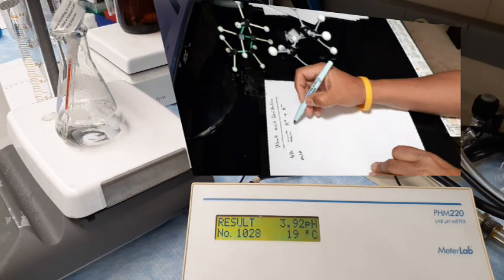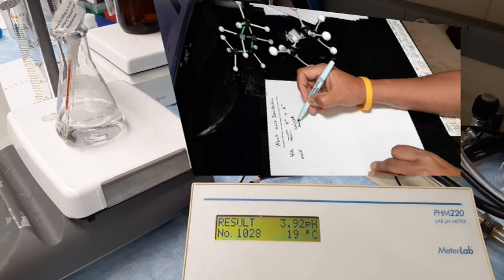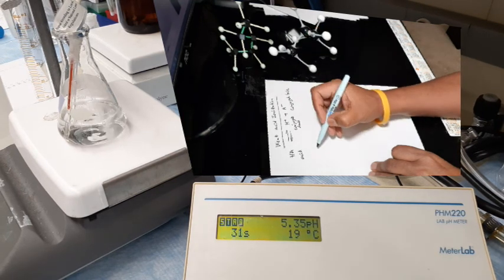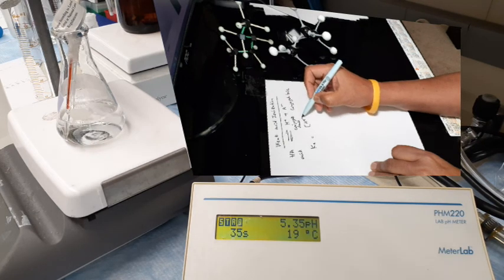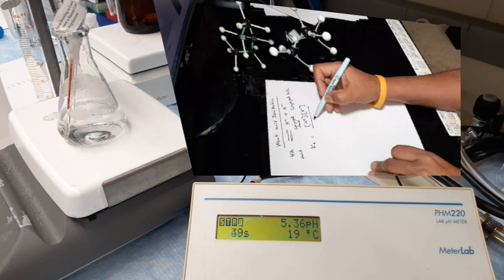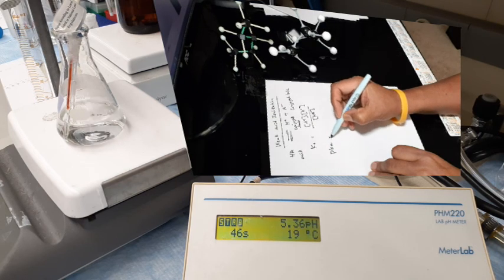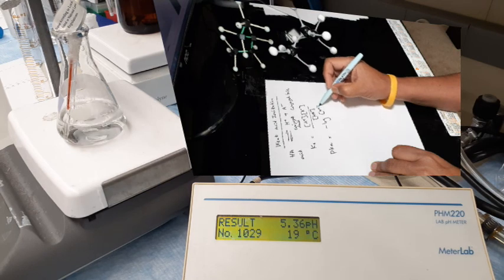At 34 ml of sodium hydroxide, we see a pH of 3.92. So it's slowly going up. This looks like the highest jump. It should be an equivalence point, because from 3.92 we are jumping to about 5.35. So it definitely shows a point where there is a proton exchange. That means there is an equivalence point where the sodium hydroxide has been used.